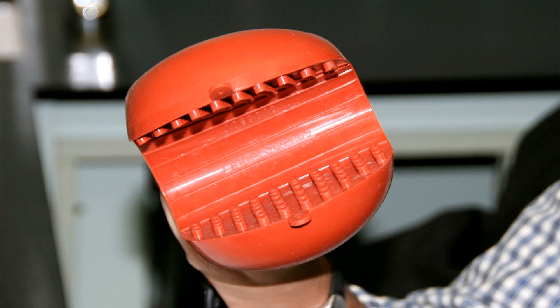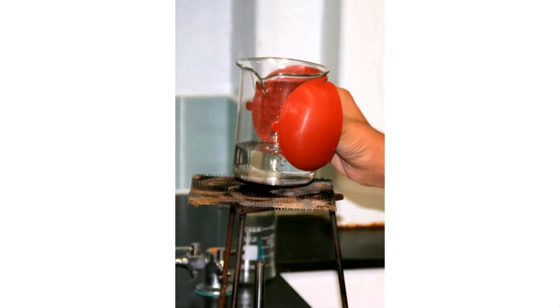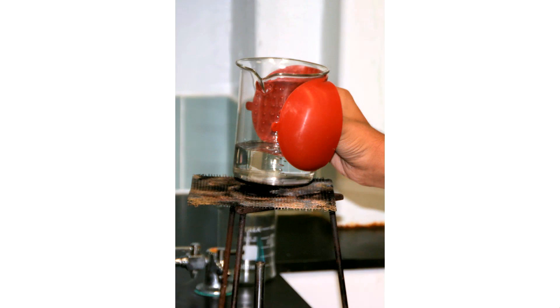This is what I would suggest you use to carry a hot beaker — these are called hot hands. You get various varieties; some labs might just have a big oven mitt. Use something like this to hold your hot glassware; it has better grip, especially if the glass is wet, better grip than metal on glass. So don't use metal tongs to carry hot beakers — use hot hands or an oven mitt.